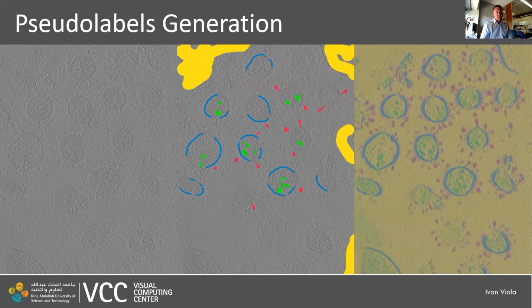And I think this is a good suggestion, that for the background versus foreground segmentation, creating soft labels using this denoising is actually a good idea. But you cannot go further than that, because discriminating the internal part of the specimen, the envelope and the spike proteins will not be part of this denoising. But at least the two-class soft segmentation can be done with that approach. Yes, that's a good idea.